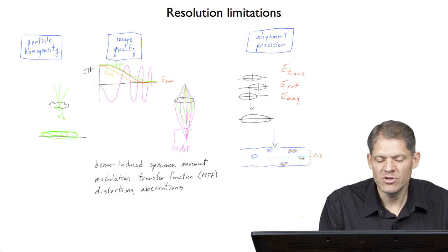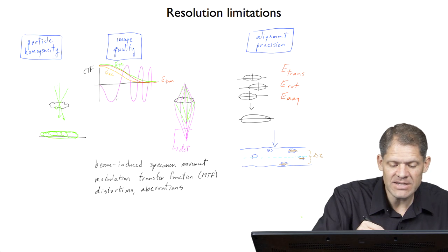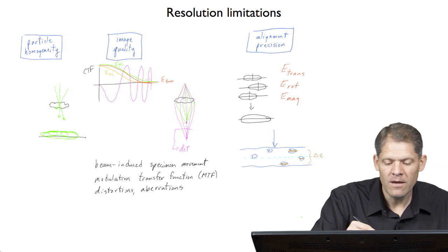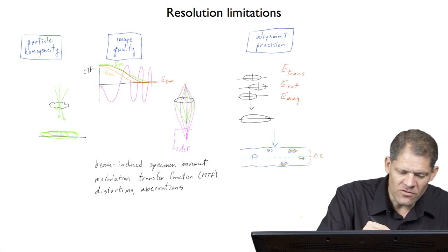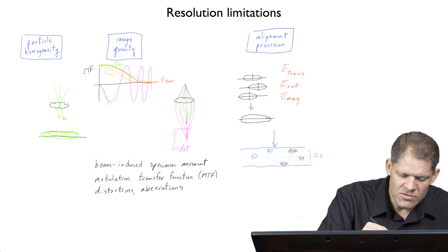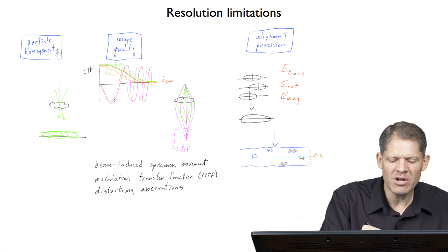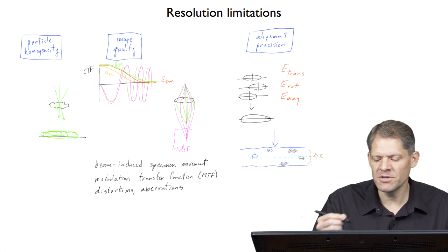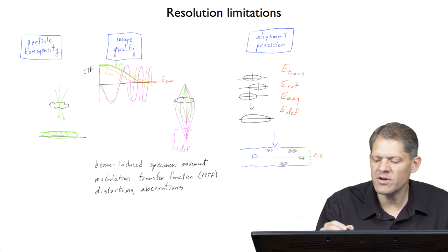And just like the envelope due to temporal coherence, if one particle truly has a CTF as shown here in purple, and we try to estimate its defocus, and we are wrong by a little bit, and so when we CTF correct it, we use a CTF, say like this, which is not exactly what was actually present in the microscope, you see that it doesn't have much impact at low resolution, but in the higher resolutions, we're CTF correcting it wrongly, and the net result is another envelope function. So let me describe that envelope function as an envelope due to defocus errors.